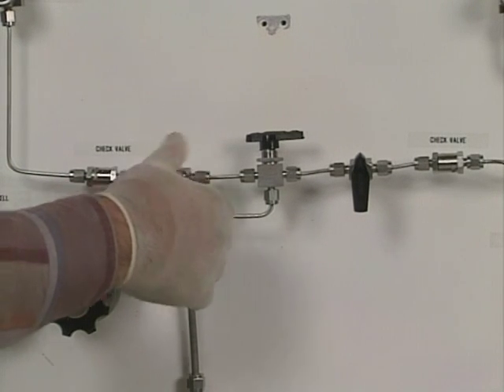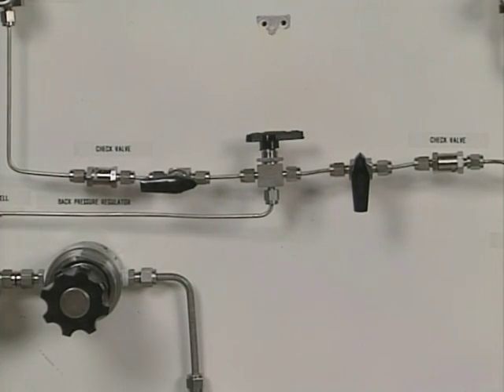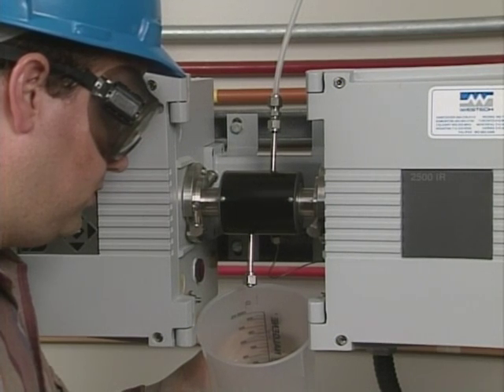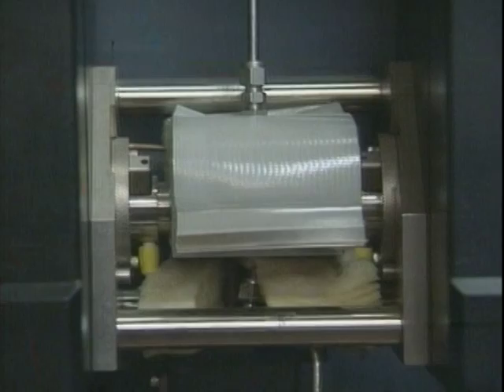After flushing, purge the sample cell with air or nitrogen. If the sample cell is still dirty after purging, disassembly is necessary, and you'll need to remove the cell from the analyzer. If the analyzer cell is heated, disconnect the heating element. Be careful not to pull or strain heater connection leads at any stage of cell assembly removal.